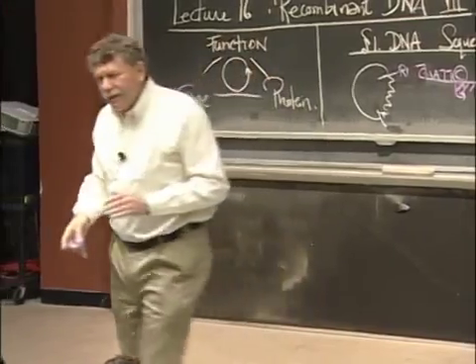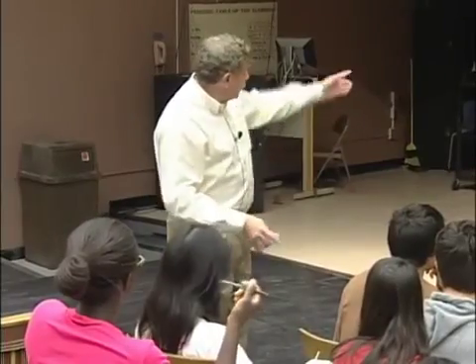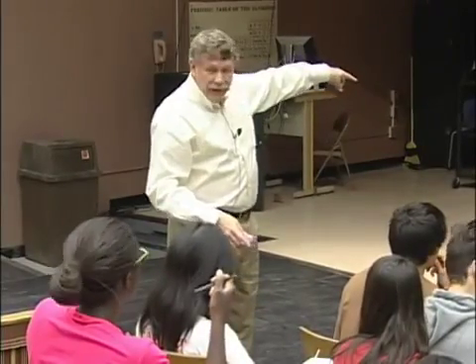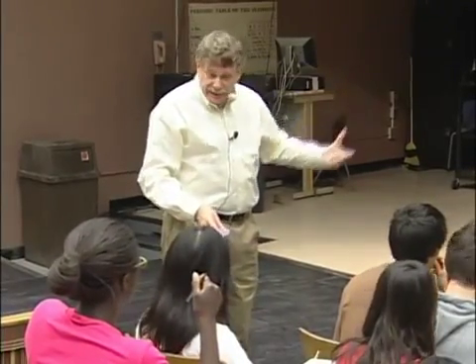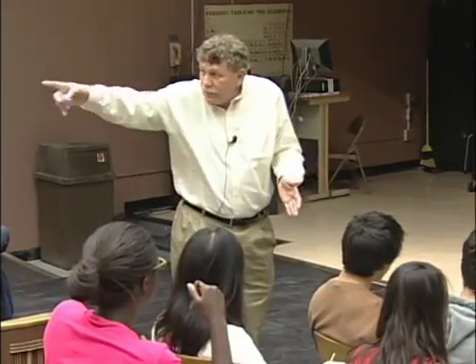Doesn't the bacteria already replicate that DNA? Yes, it replicates that DNA just fine, so there's already a primer in there. Why do you need that? Well, because I've now purified out my insert, and I'm going to subject it to sequencing, and I need to start with a primer. I got that fragment. I need to know how that fragment starts, and I don't know how that fragment starts.